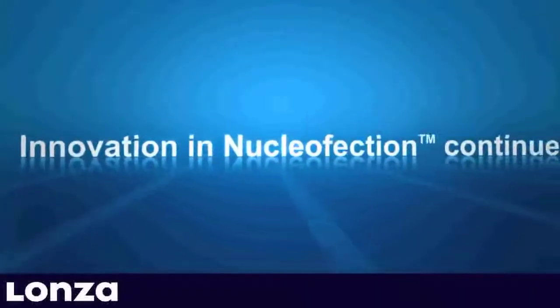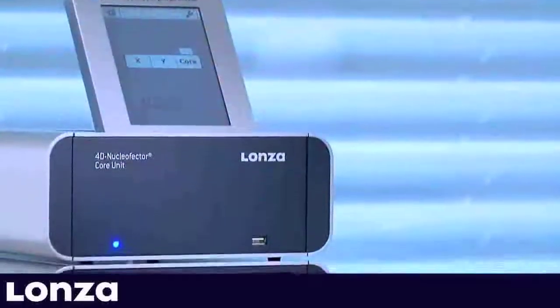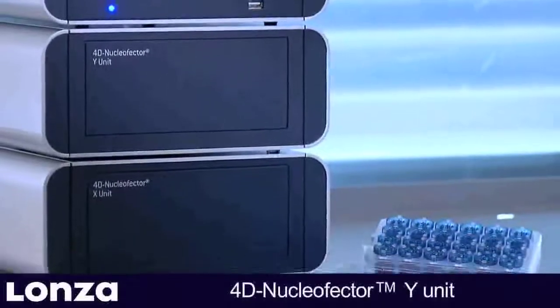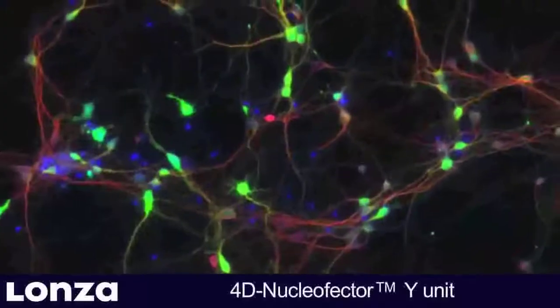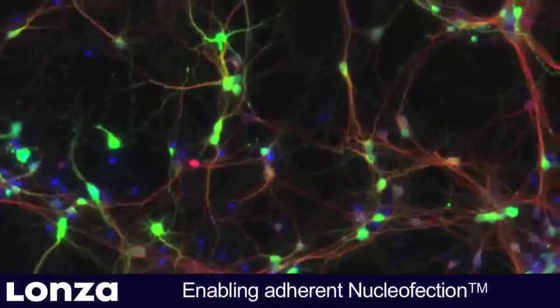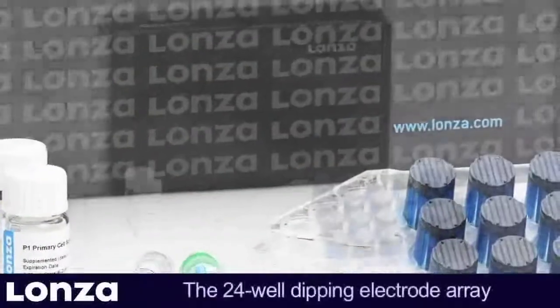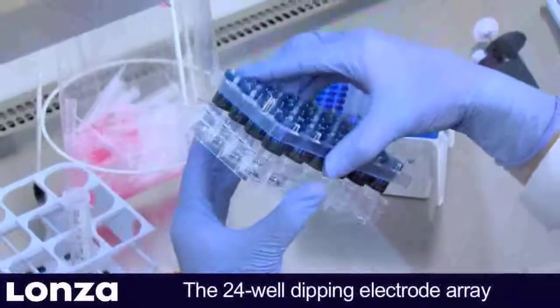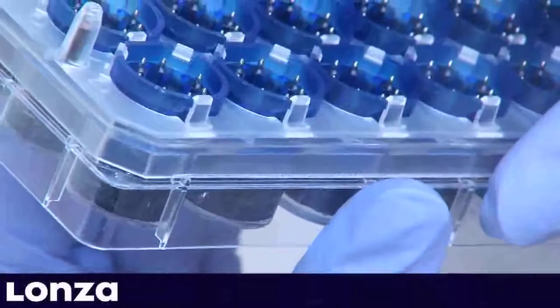Innovation in nucleaffection continues. The 4D Nucleaffector Y-Unit, enabling adherent nucleaffection in 24-well culture plates. In this video, we demonstrate how to successfully transfect adherent cells, in particular neurons. The Y-Unit uses disposable conductive polymer 24-well dipping electrode arrays that are inserted into standard 24-well culture plates for transfection.